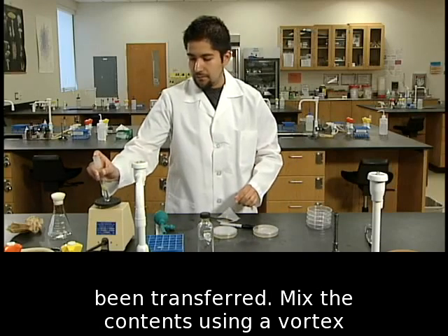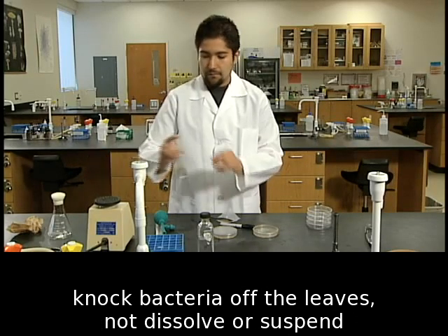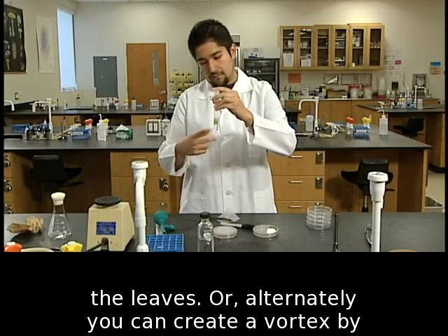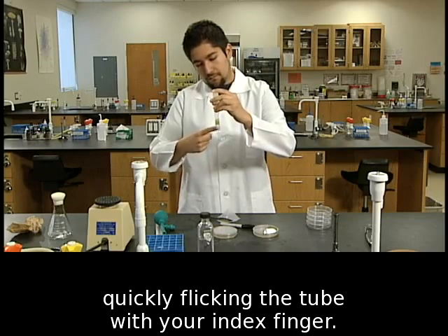Mix the contents using a vortex mixer. Hold the tube at an angle. You're trying to knock bacteria off the leaves, not dissolve or suspend the leaves. Or alternately, you can create a vortex by quickly flicking the tube with your index finger.